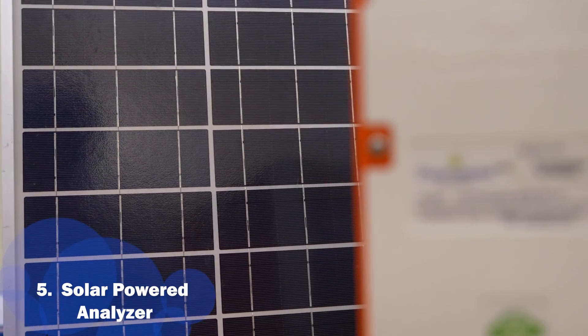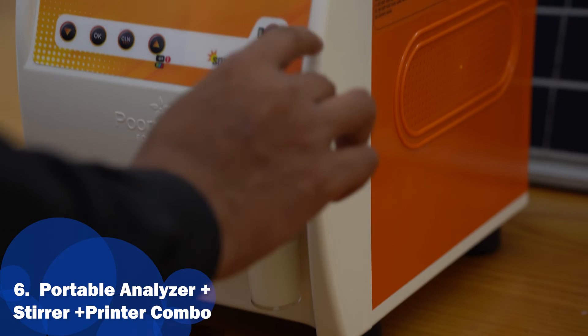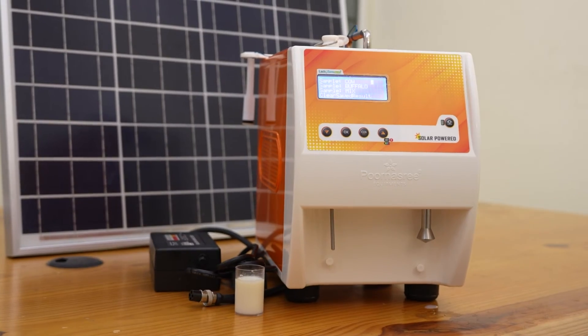The solar panel provided is 50 watts. The biggest strength of the machine is that it is a portable analyzer plus stirrer plus printer combo.